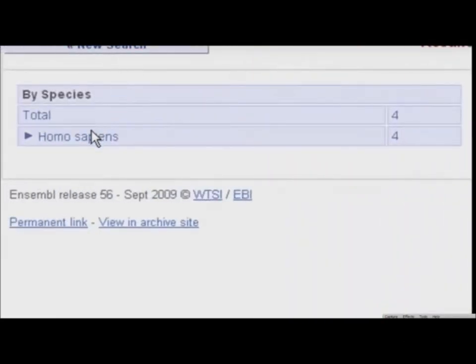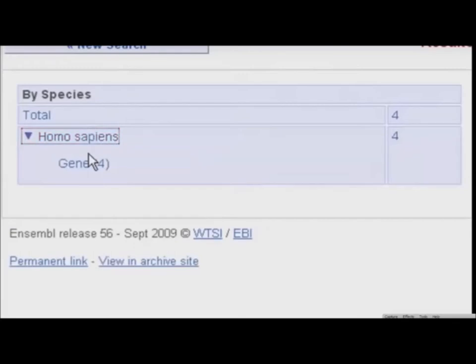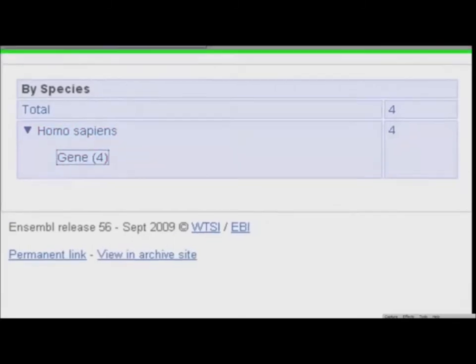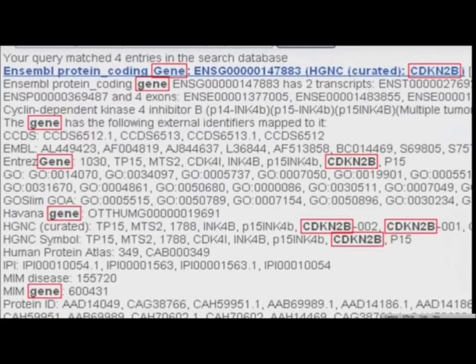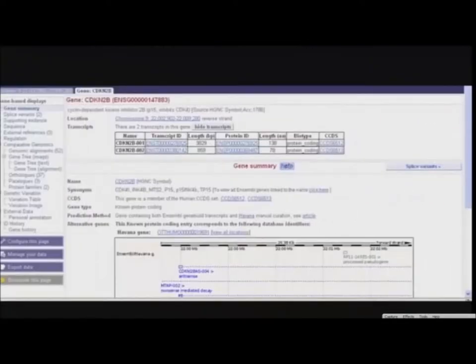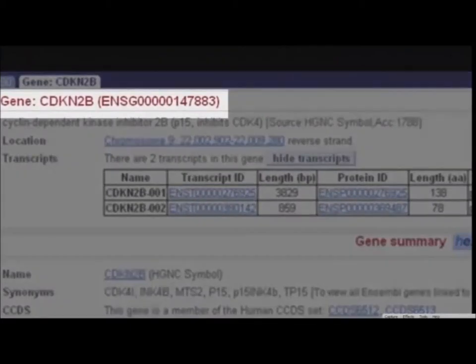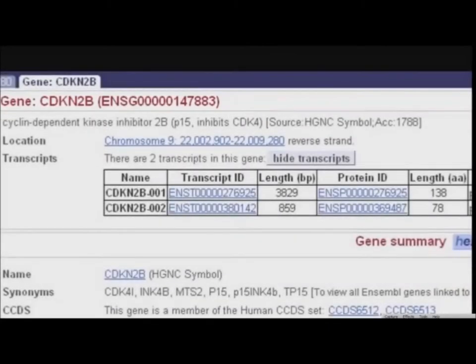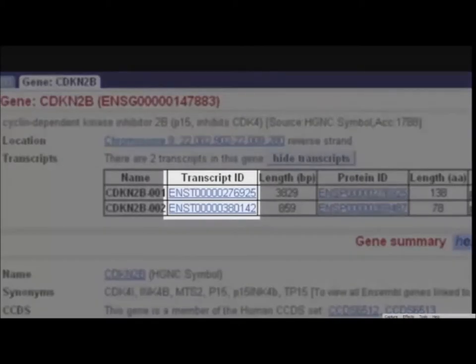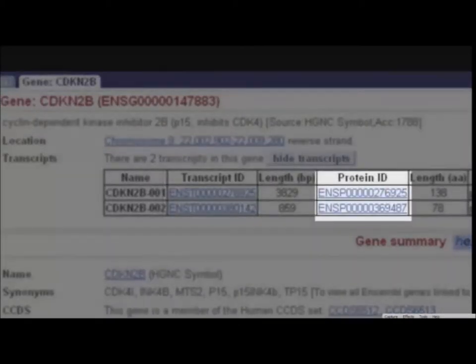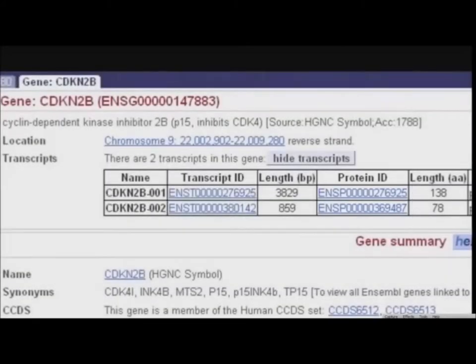Let's expand Homo sapiens and Gene. Click on this first hit to go to the Gene Summary page for CDKN2B. The Ensembl gene identifier for this gene is ENSG00000147883. This identifier is stable, meaning even if the gene is updated, the ID should remain the same. Other stable IDs in Ensembl include ENST for transcript, ENSP for protein, ENSE for exon, ENSR for regulatory feature, and ENSFM for protein families.